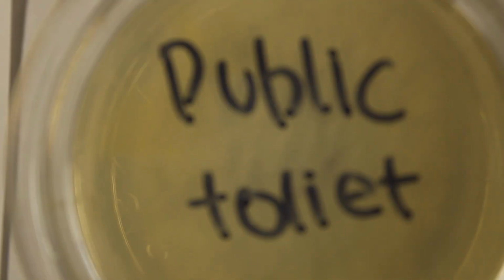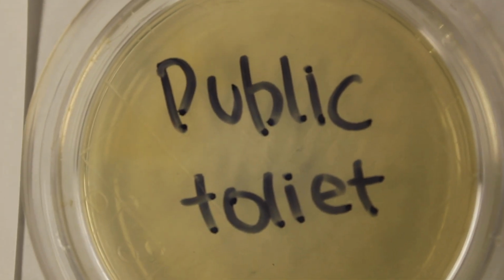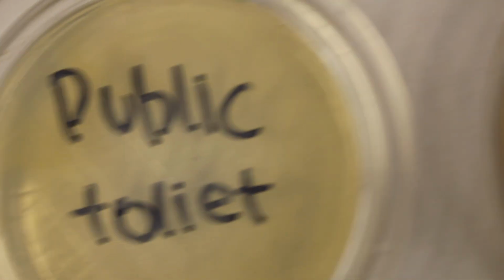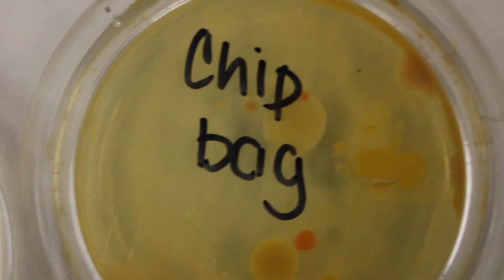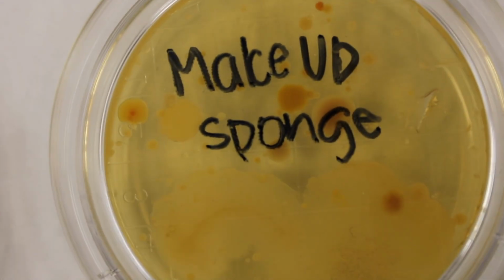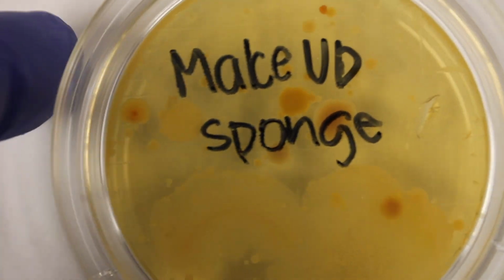We have here contact plates where we incubated them for 48 hours from a public toilet, the palm of your hand, a handrail on stairs, a can, computer mouse, yoga mat, elevator button, chip bag, and makeup sponge. Now we're going to look at each one of these here. I'm going to pull this over.